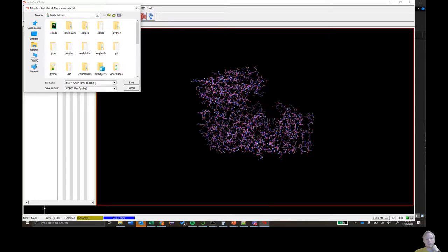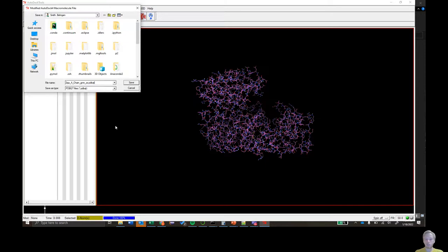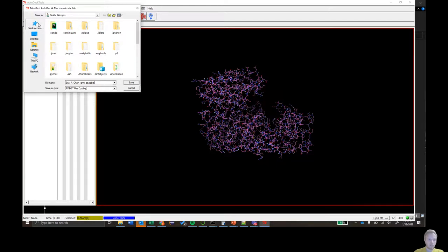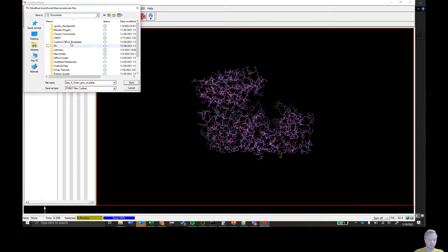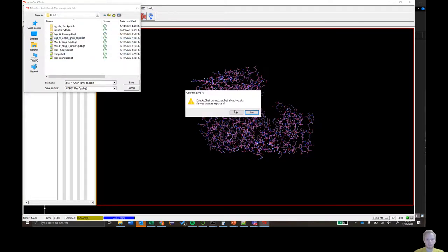The charge column records the charge of each atom, allowing the software to determine if the drug will be attracted or repelled at a certain site. The type column records what kind of bonds are formed — whether it's a hydrogen bond donor, hydrogen bond acceptor, etc. We're going to click Access, Documents, Crest, and save it as a PDBQT file.